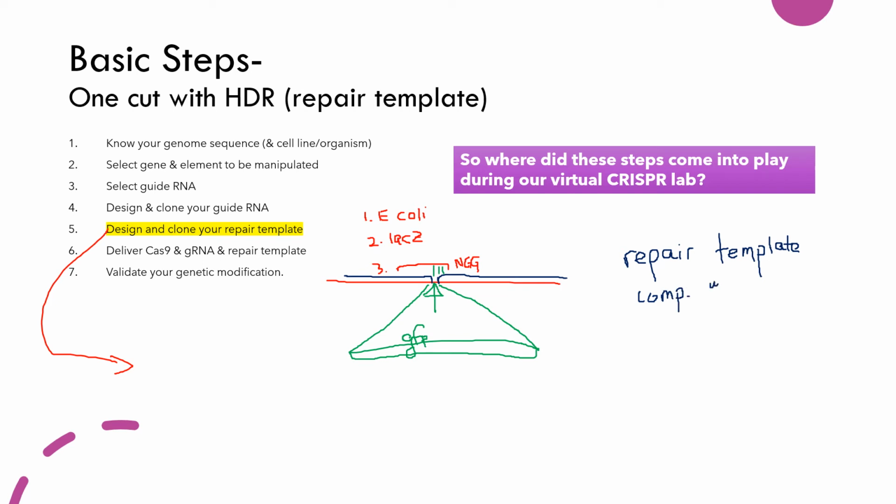with cut site. Okay. So we spent some time in lab trying to discuss and design the Gibson cloning to do this. So what we did in order to do Gibson cloning, we're going to use the pUC19 as the source of our arms for the repair.